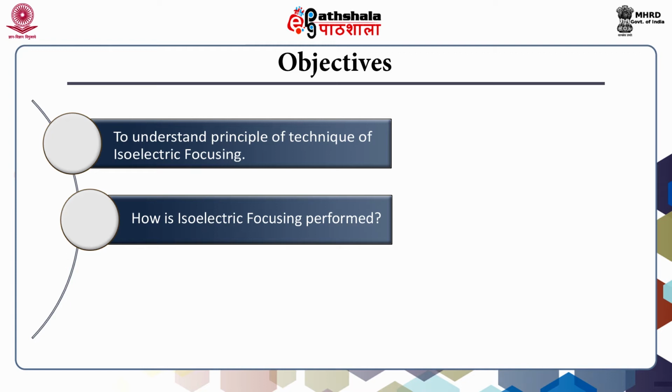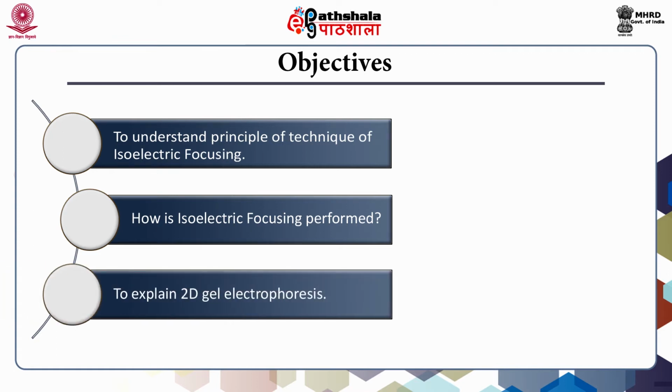SDS-PAGE and isoelectric focusing can be used in combination for enhancing resolving power, and this is referred to as two-dimensional gel electrophoresis. This aspect will also be covered.